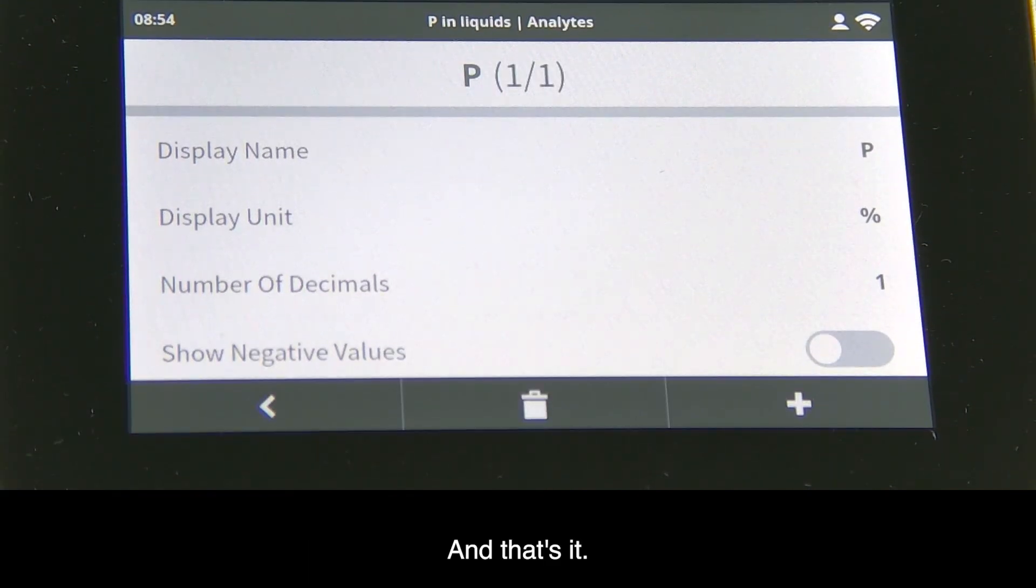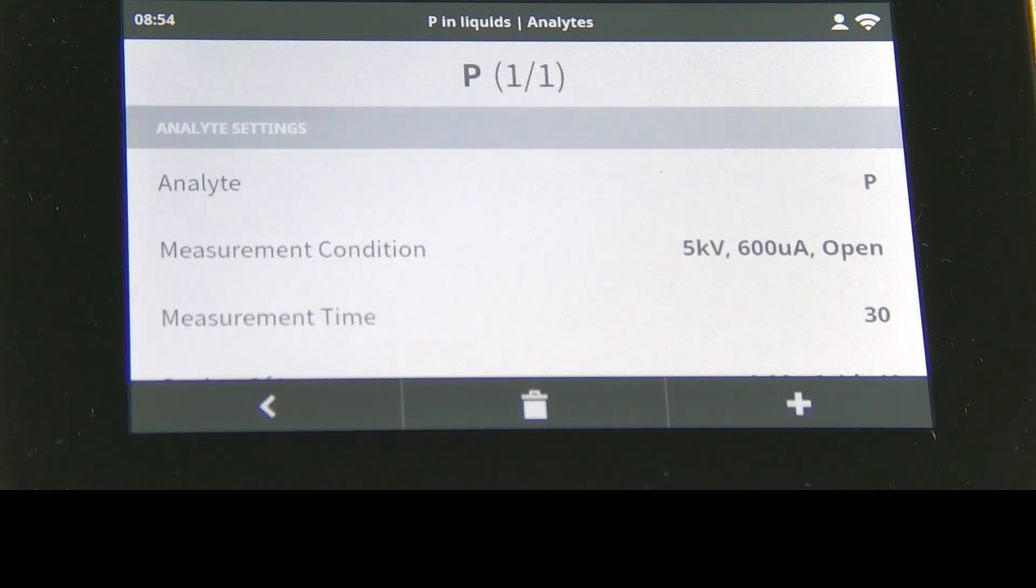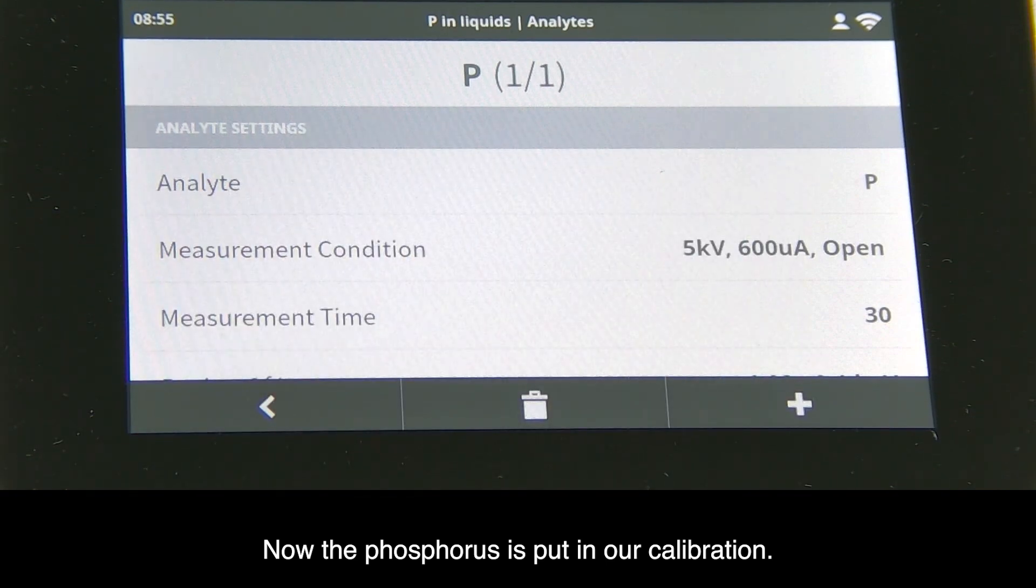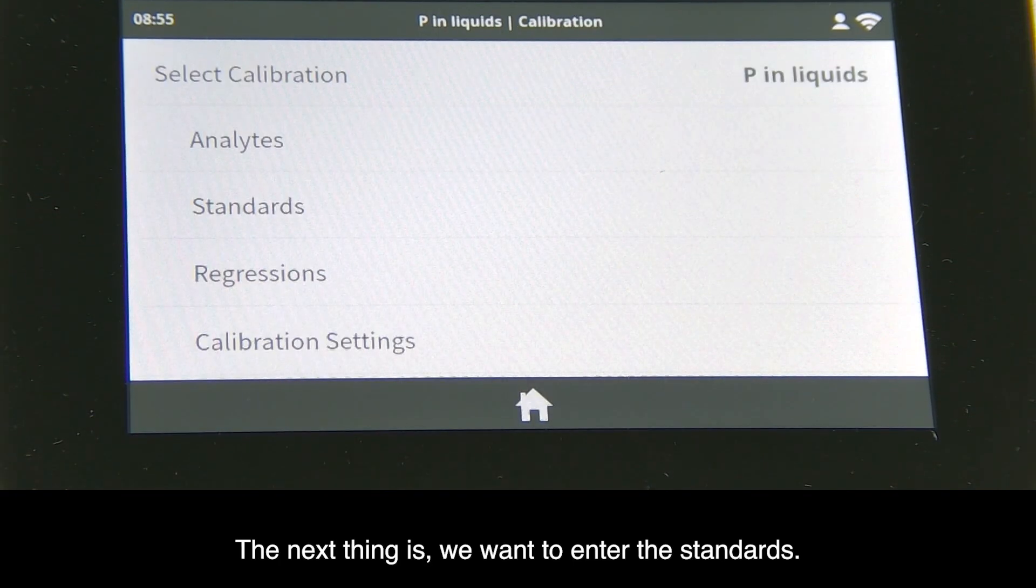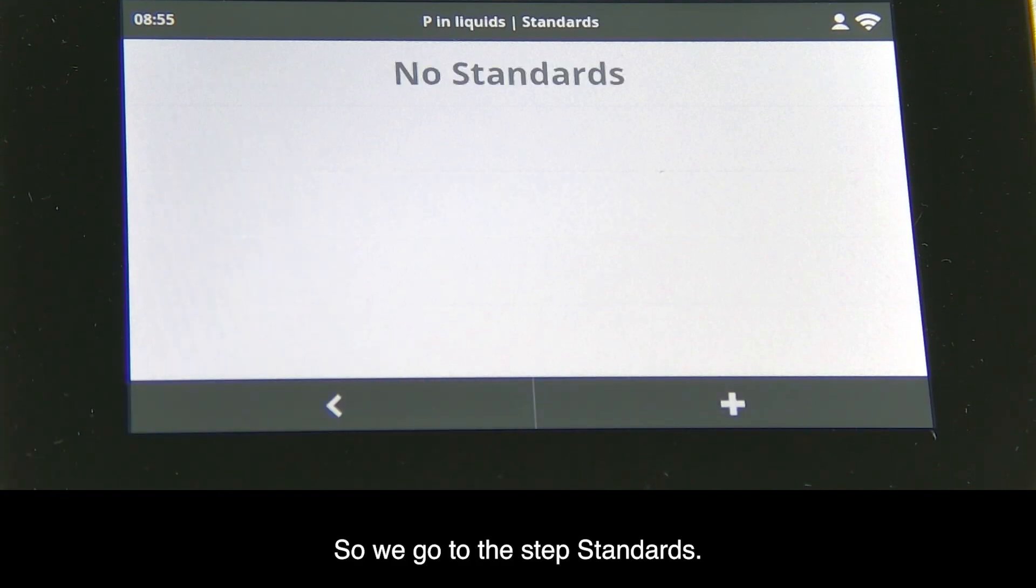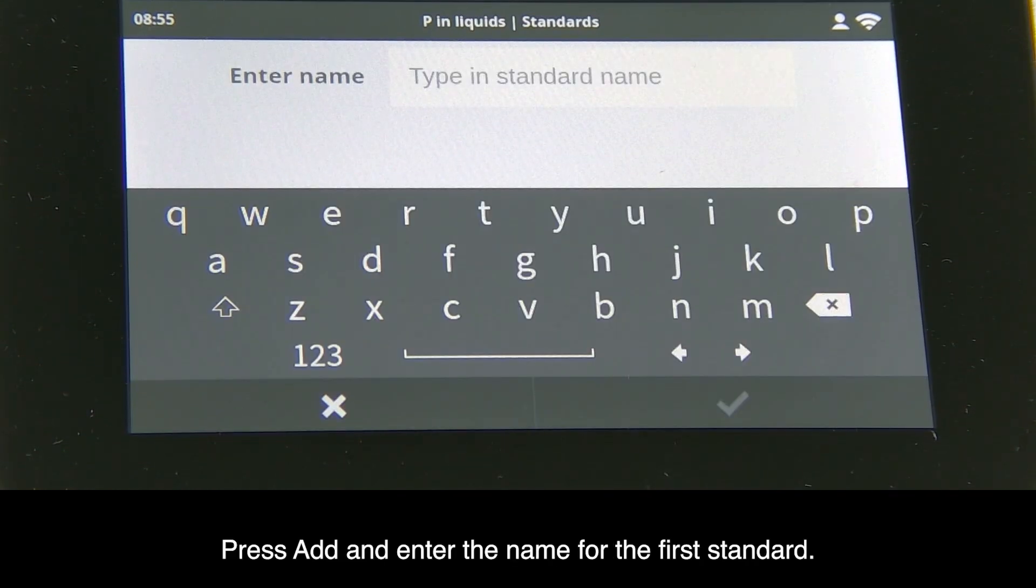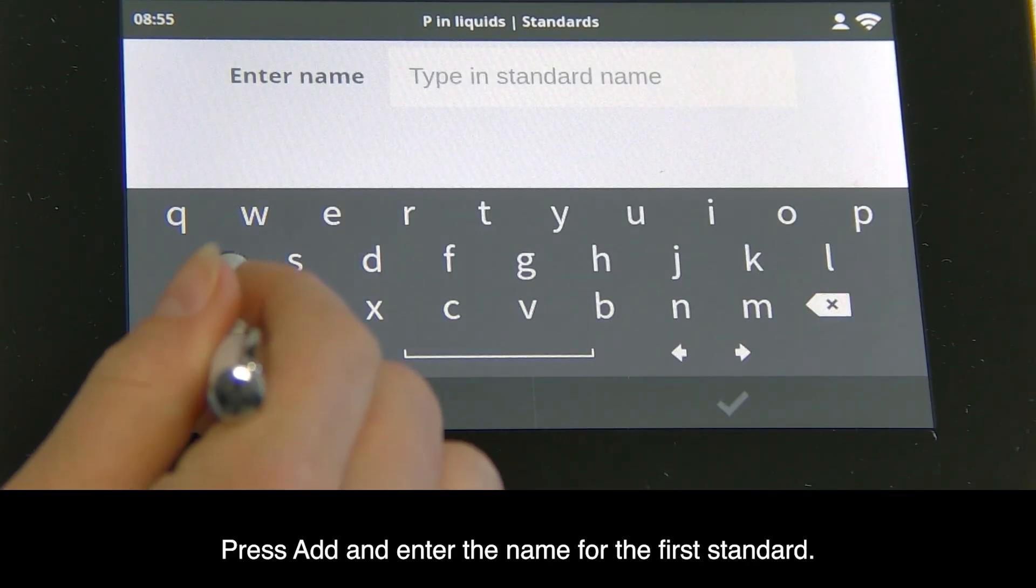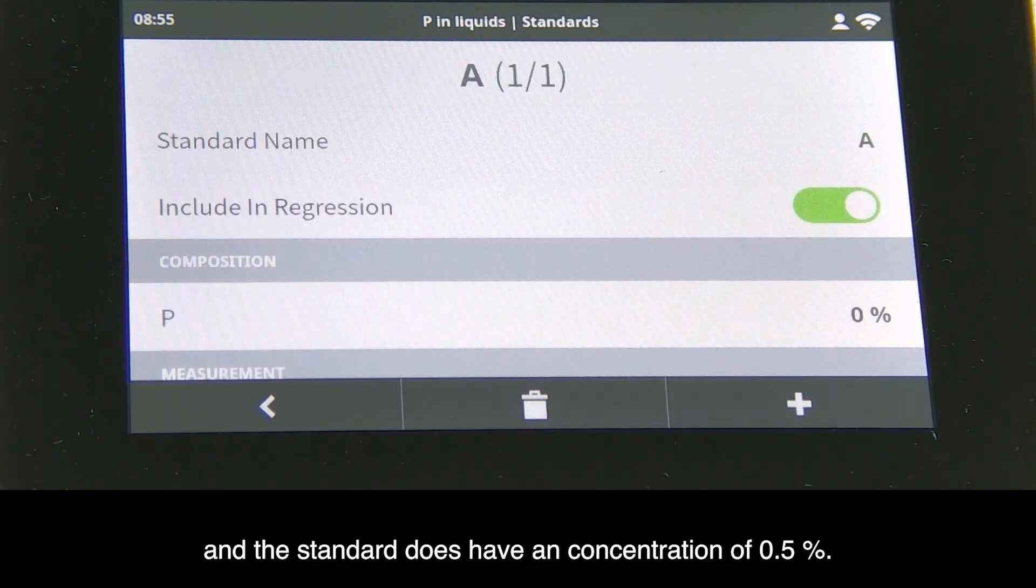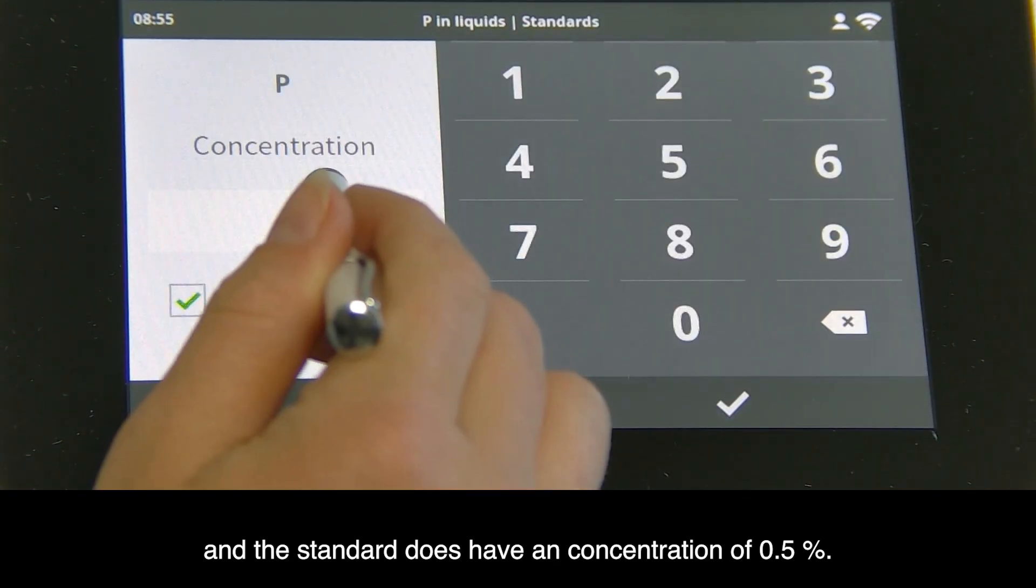Go back and check - now phosphorus is in our calibration. Next we enter the standards. Go to standards, press add, and enter the name. Our standard is A with a concentration of 0.5 percentage.